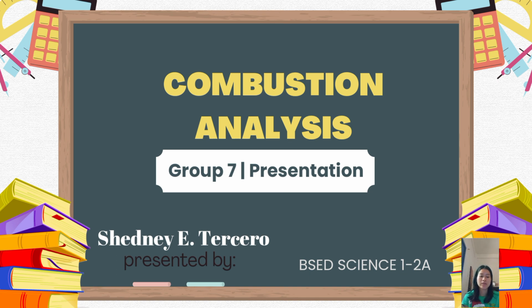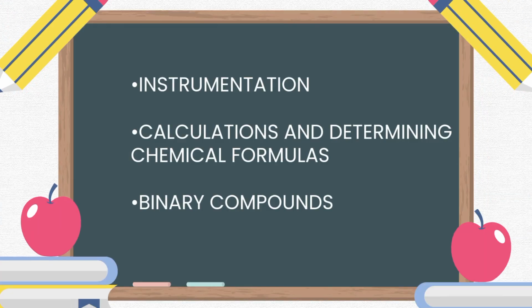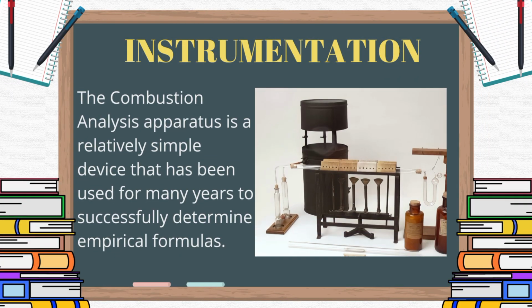Combustion analysis, which is a continuation of Lorraine's report. In this report, I'll be discussing the instrumentation, calculations, and determining chemical formulas, and also binary compounds. Let us now discuss the instrumentation first.